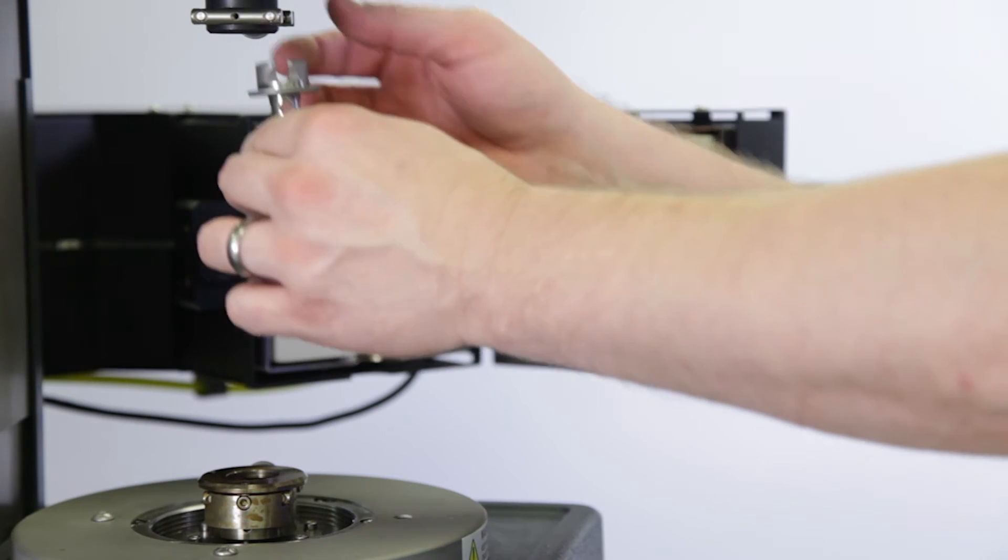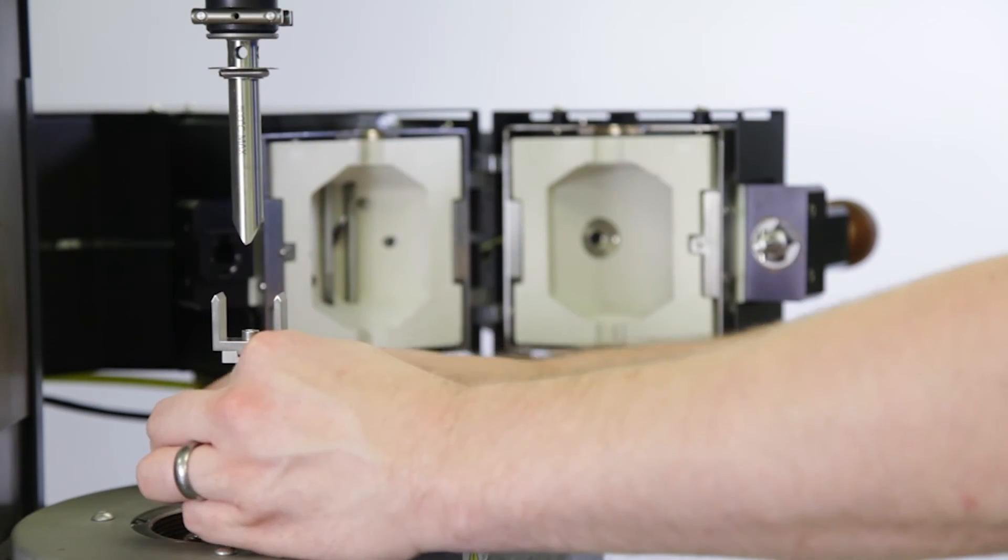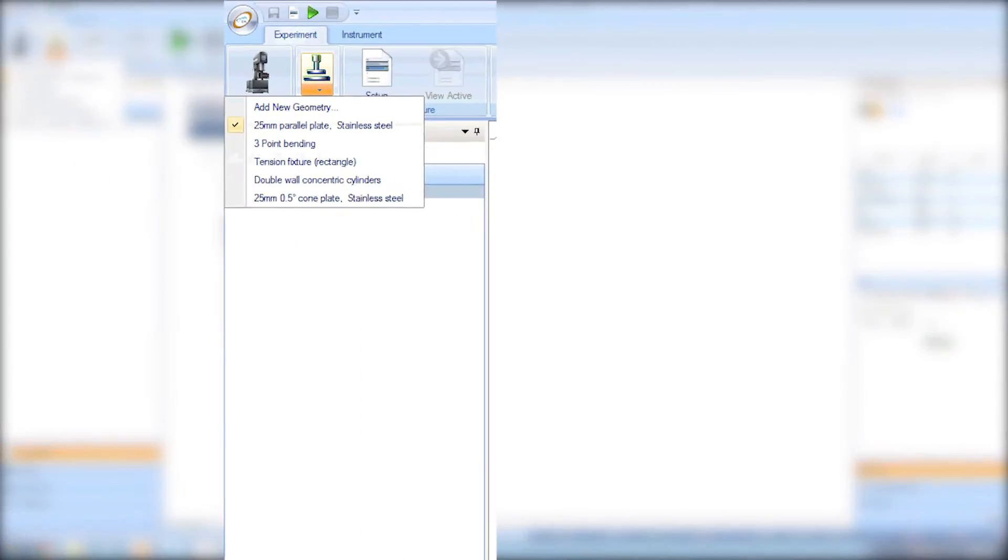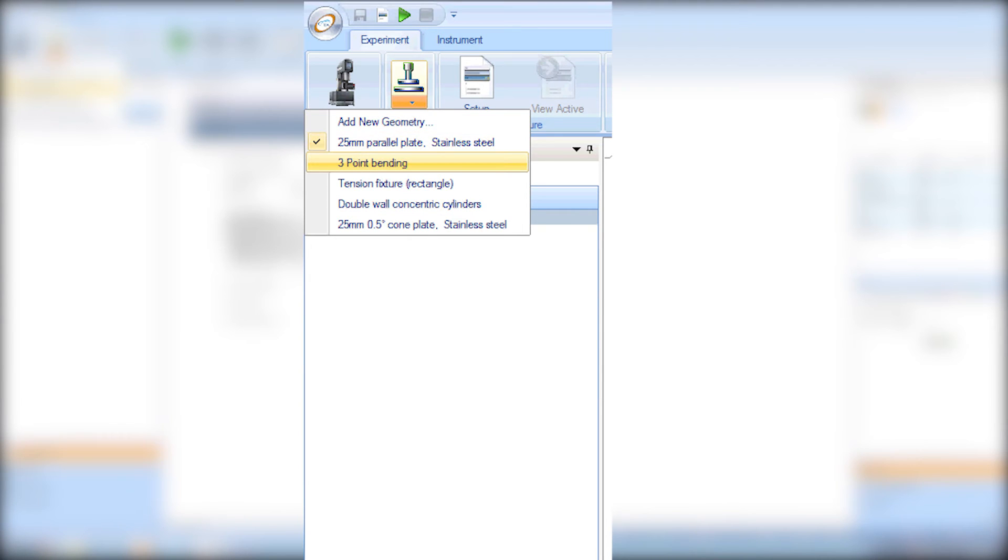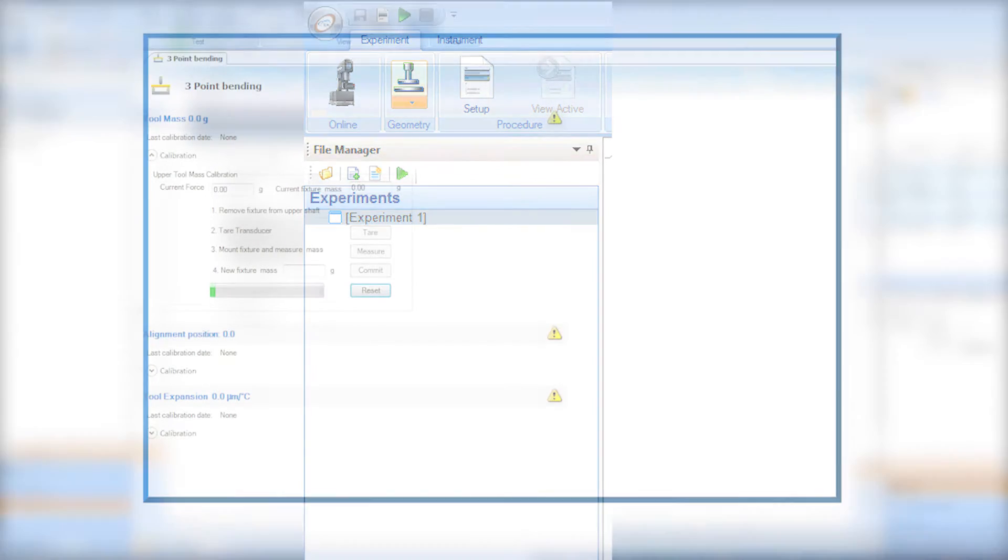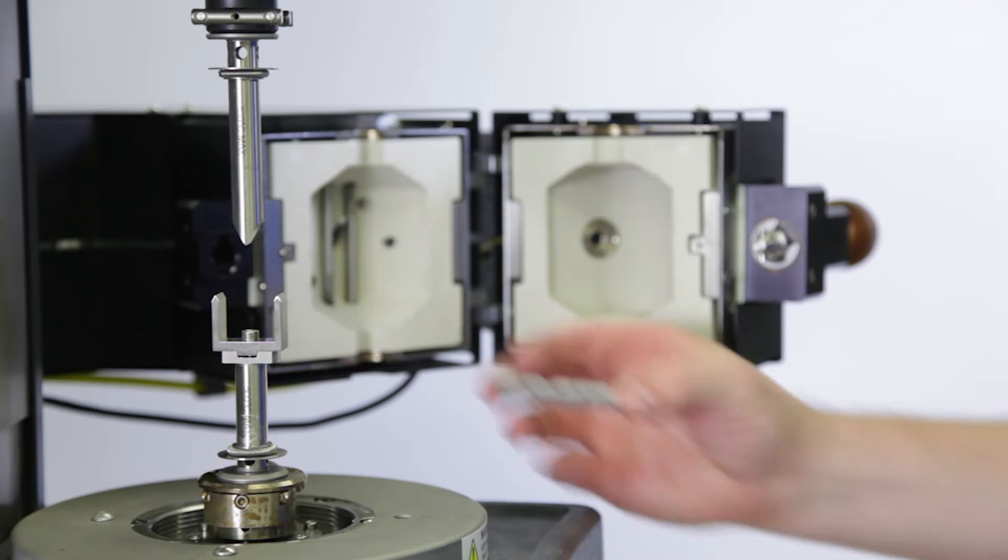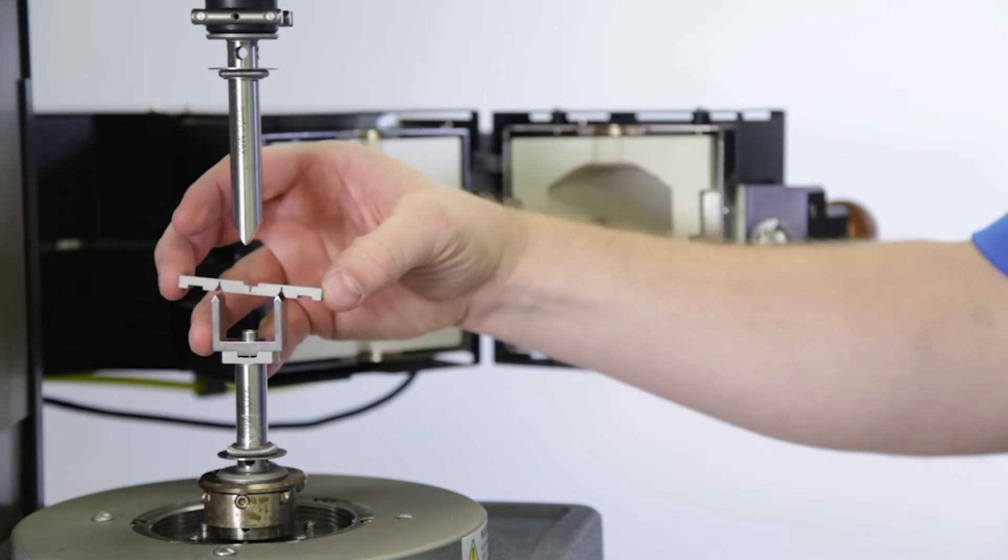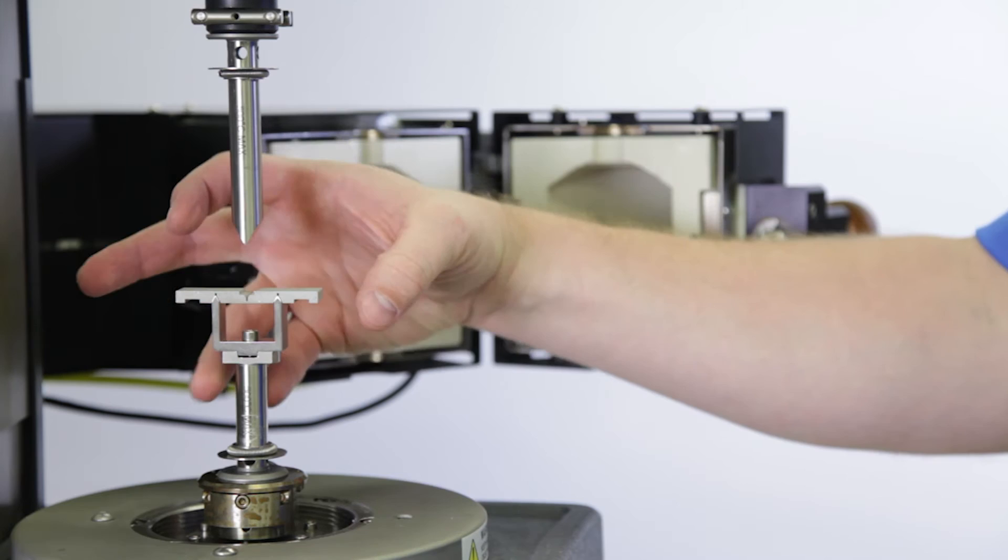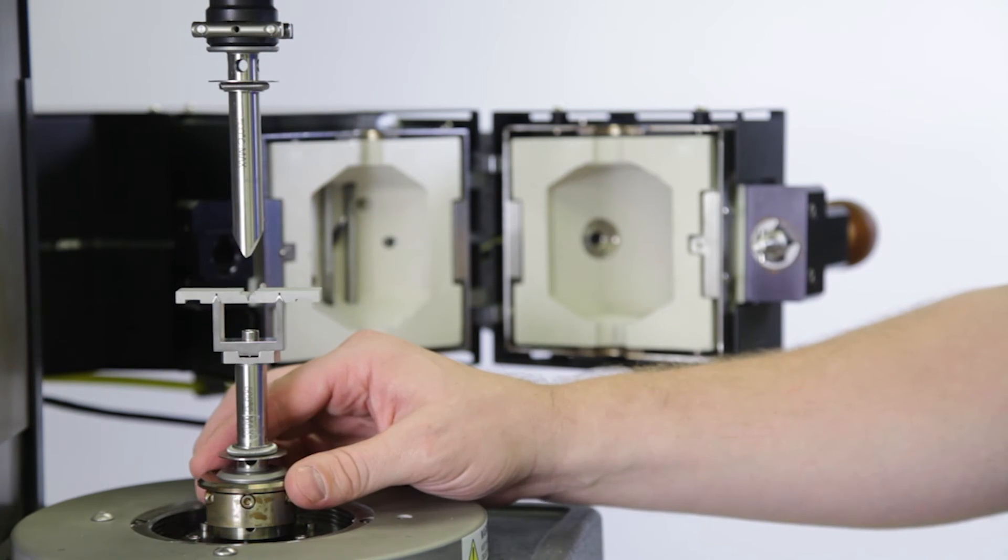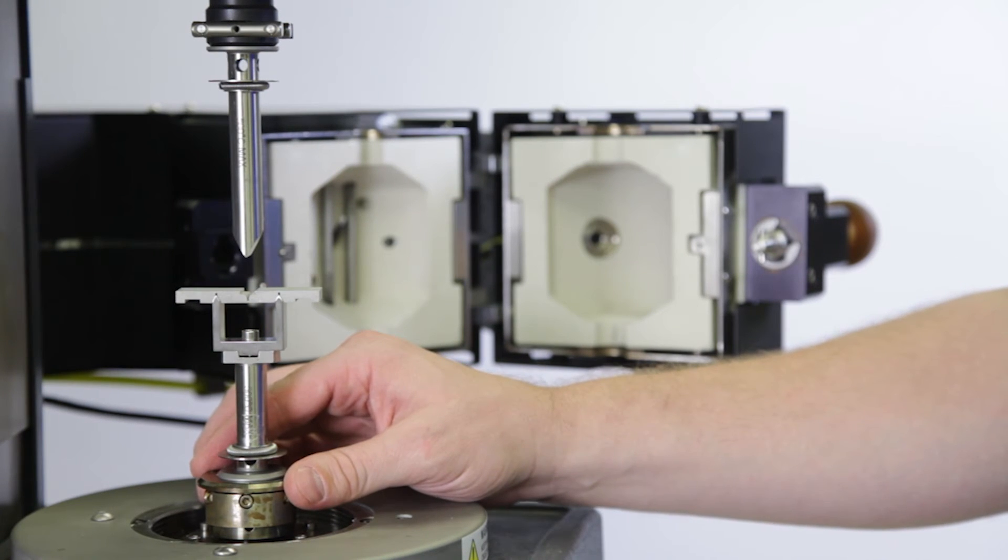Mount the fixtures to the ARIES G2 with the 25 millimeter frame and select the three-point bending geometry from the drop-down menu in TRIOS ribbon. Proceed to the geometry calibration window and calibrate the geometry mass. Once completed, install the alignment tool onto the frame.